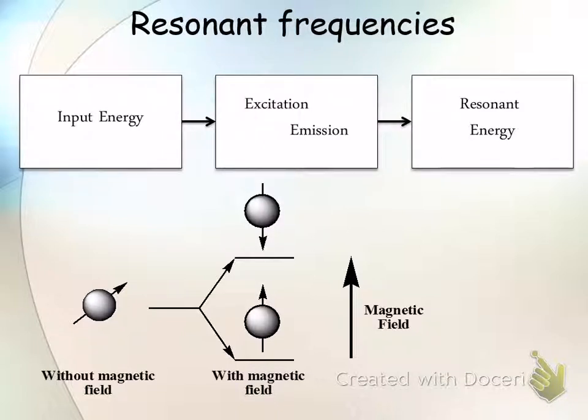We pulse the molecule with it. Sorry, I had to bring in that video game terminology, because it's in my brain. You pulse the molecules, and then the hydrogens that are at the low energy state will go into the high energy state, and they'll sit there for a while and eventually decay. And when they decay, they produce a frequency of signal that comes out that's going to be proportional in part to the size of the magnetic field.